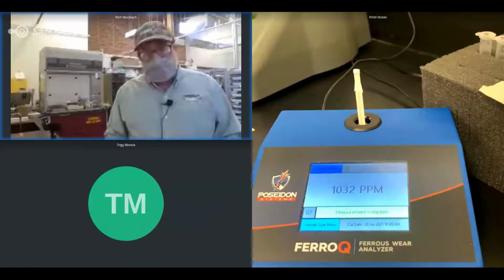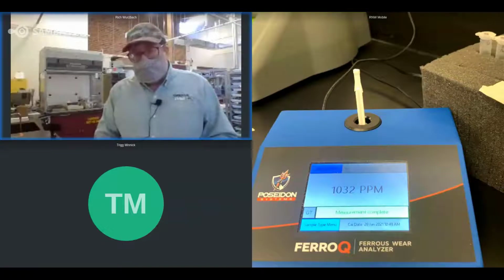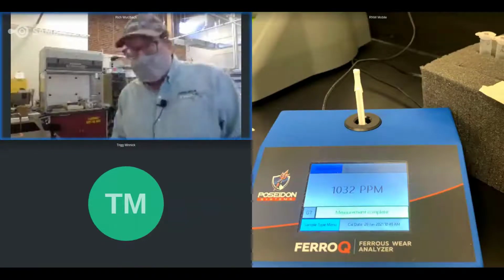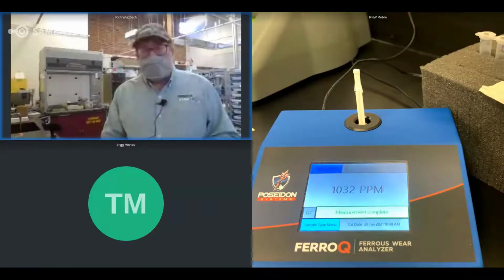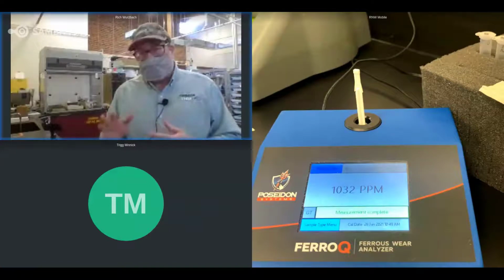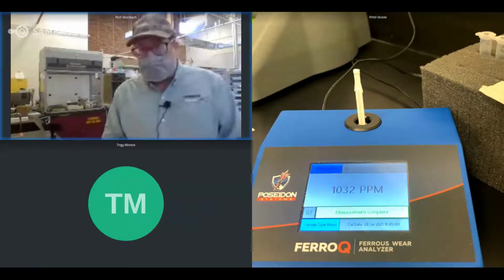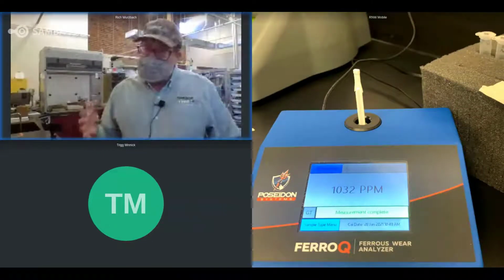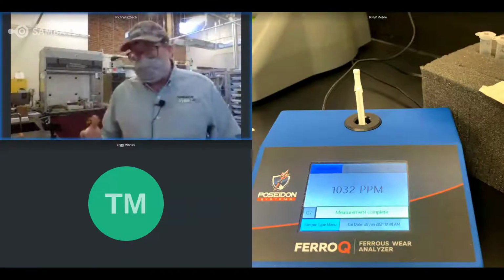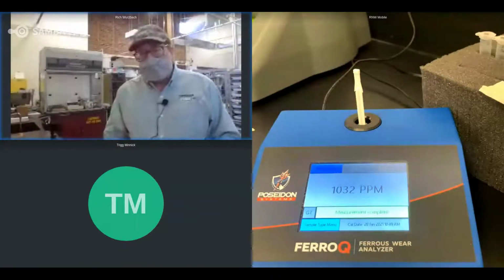And depending on the technique there, it's measuring what you have as dissolved content, so dissolved iron content, and small particles. Now, the size of the particle really depends on the technique. For ICP, it might only be up to about the 3 to 6 micron range that you're really measuring and reporting out in that value that you see as ppm. When you use RDE, that size range is a little bit larger. It might be up to 10 microns. XRF doesn't have that limitation, but that's not usually what we get in our reports.